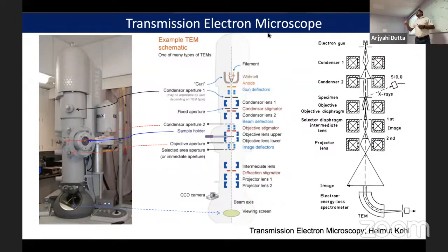And that resolution is highly dependent on this lambda. And that is the limiting factor here. In the electron microscope, the lambda is smaller, and that is why the resolution is much better. And the second one is the penetration power, right? These two things are the reason that even if we add 200 glass lenses, we cannot make it, and we cannot get very high resolution images.